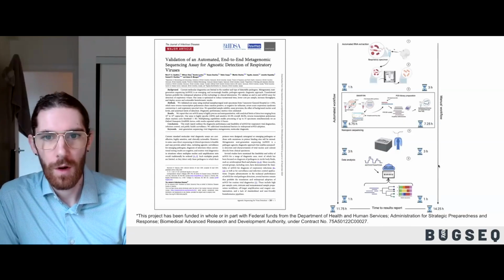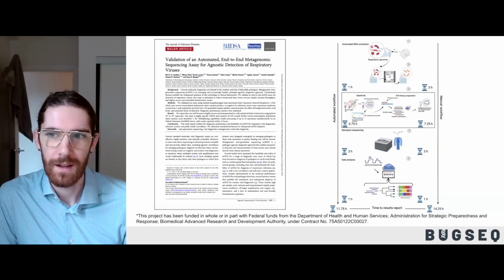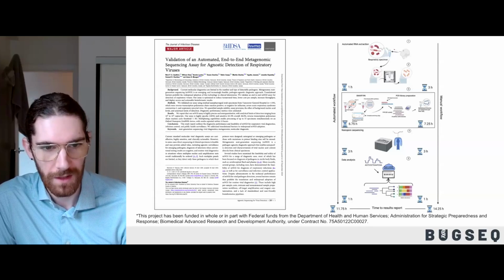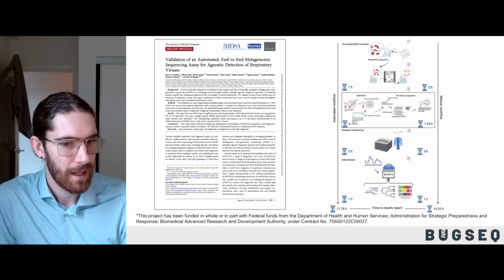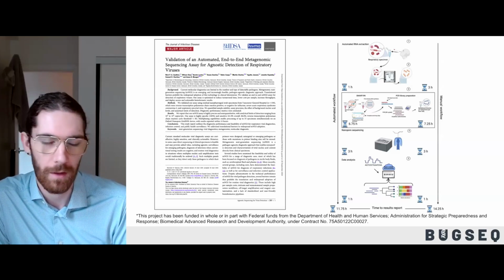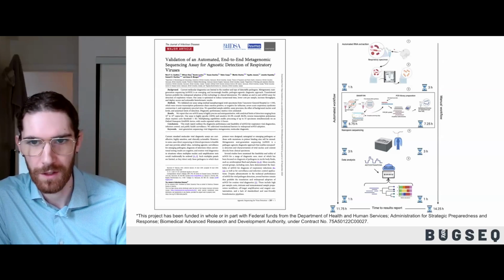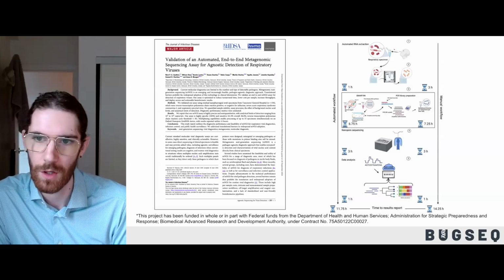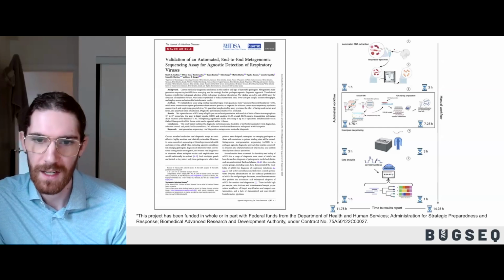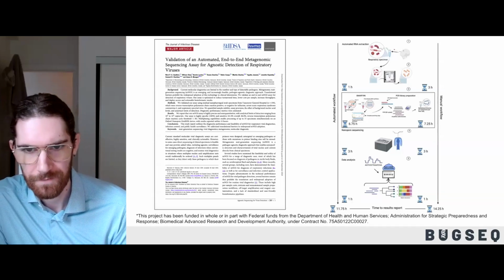So following that, a few years ago, we began working through a BARDA-funded project to develop an automated end-to-end nanopore-driven metagenomic sequencing workflow alongside those collaborators at the University of British Columbia and Vancouver Coastal Health, wherein we automated a workflow from extraction and sample prep through library preparation, including using an optimized version of the Rapid SMART-9N protocol, and multiplexing of up to 12 samples per flow cell that enabled simultaneous processing of up to 60 samples at once on an ONT GridION sequencing device.